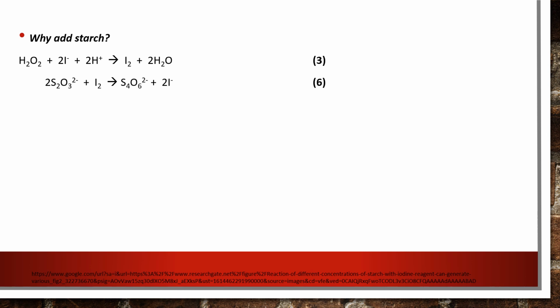The time taken for all the thiosulfate ions to be consumed is easily monitored and can be used to give information about the rate of consumption of the reactants in this experiment as we just saw. However, to monitor the time it takes for reaction 6 to occur, we need to know at what point it started and when it ends. We now know that it started at the beginning of the reaction as soon as iodine is produced. But at what point did it end?